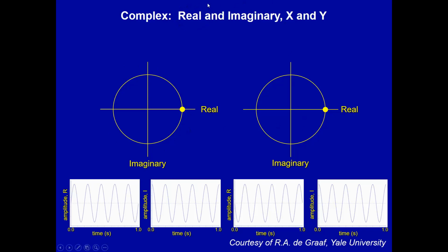You may hear terms, you may show up one day and find, oh, you can't run your experiment. I'm sorry, there's a problem with the real channel. There's a problem with the quadrature detection. When the quadrature detection goes out, we don't get a perfectly overhead view of the XY view. If it's a little bit off of adjustment, then it's as if we are looking at this circle from a slight angle, and that introduces a very slight ambiguity in whether things are positive or negative.